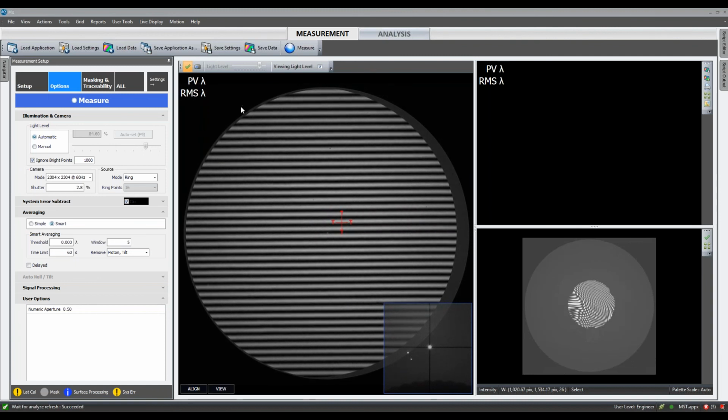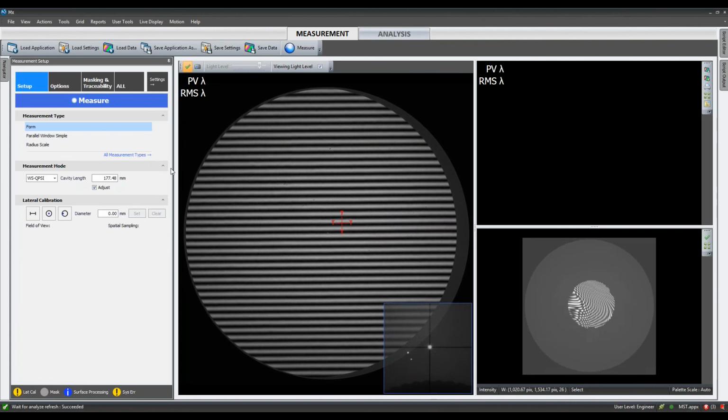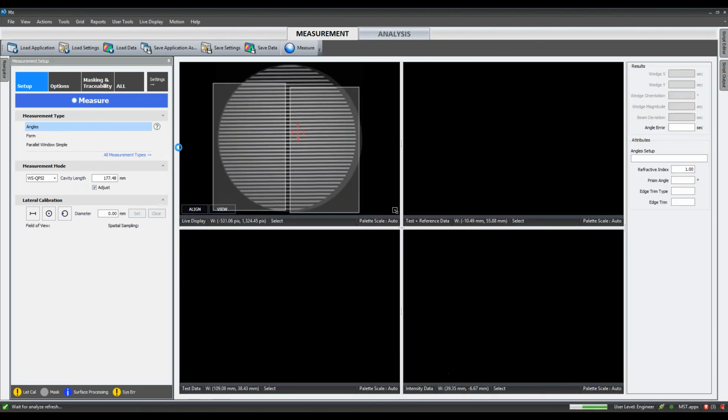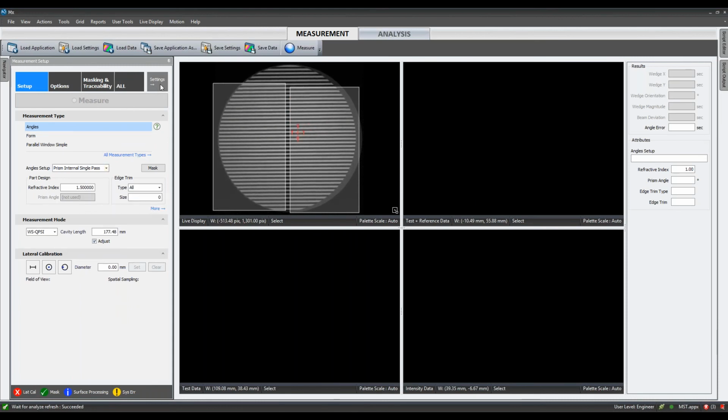One thing that I didn't mention at all, that's quite handy, is for switching between measurements, like what I've been doing here, where you might want to have some settings that you can quickly apply. For example, when we did that prism, we had these masks drawn, we had our refractive index set, and various other settings. We can save those in this quick little settings panel here. So this is my right angle prism setting. And then we can store.